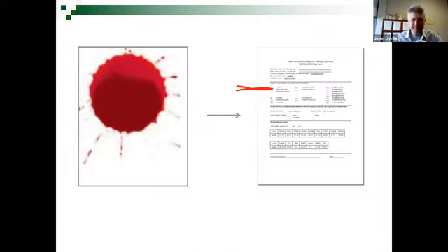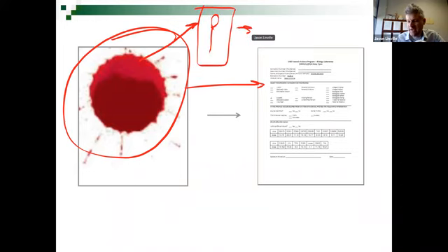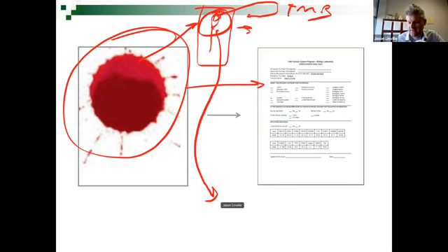Okay. So again, to summarize, throughout this entire course the concept is we find blood at the crime scene and we're converting it into this DNA report. So we've gone over the collection process. We're going to collect this on a swab. It goes back to the lab. We take a little bit of this and do a TMB presumptive test. We determine it's blood. So then we snip off the entire swab or cut out a portion of the stain, and put it through the extraction process.